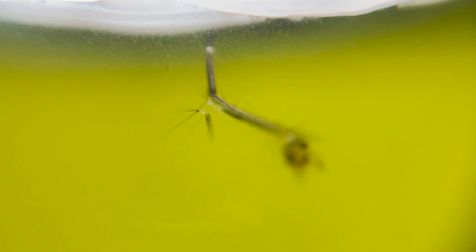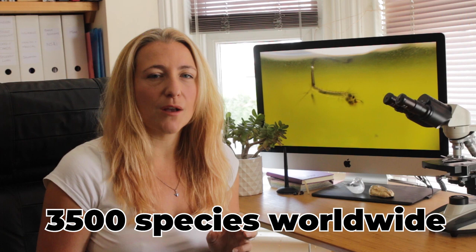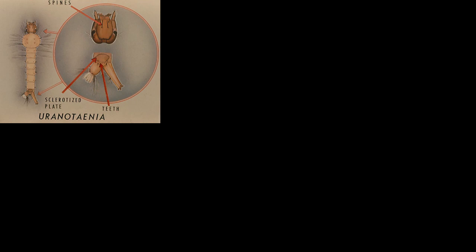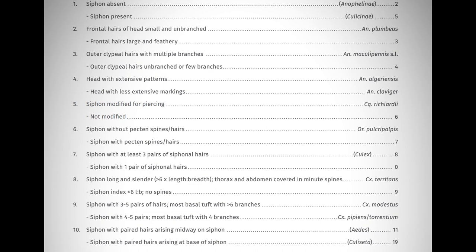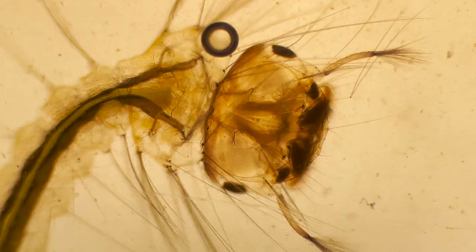To rotifers, and to most people too, mosquitoes and their larvae may all seem the same. If you've seen one, you've seen them all. But there are 3,500 species of mosquito worldwide, and at least 36 in the UK alone. Telling them apart is a job for true mosquito enthusiasts, often based on particular features of the fourth and final larval instar, like how many bristles are on the head or anal segment, or whether the siphon is long, short, or absent entirely. Now, I may be enthusiastic, but I'm no mosquito expert, and some of the classifications are a little too fine for my eyes, especially when they won't stay still.